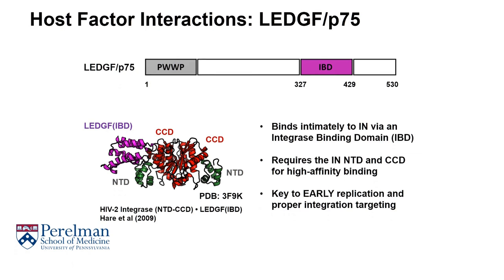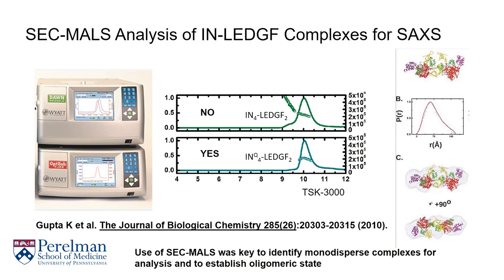In our 2010 SAXS study of co-expressed recombinant integrase-LEDGF oligomers, SEC-MALS was key to the success of that study, as we had to screen through many mutated and truncated forms of this complex to find preparations that were well-behaved enough for small-angle X-ray scattering analysis at the synchrotron. This allowed for the collection of high-quality data to allow us to propose specific structural models for LEDGF-bound integrase tetramers in solution.